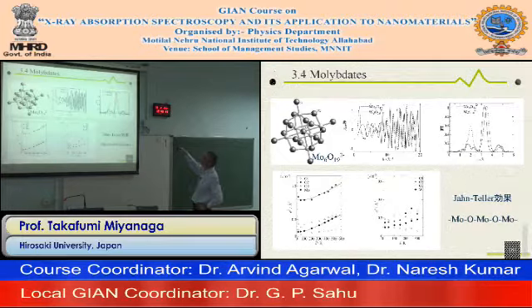Here, so this is very normal. For tungsten oxide, the first nearest is oxygen, and the second nearest is tungsten, the oxygen-bridging tungsten. But in the case of molybdenum, there is a very small peak here. The nearest neighbor oxygen disappears, but the molybdenum interactions, bridging molybdenum, are very strong.